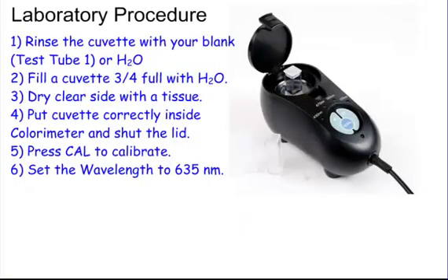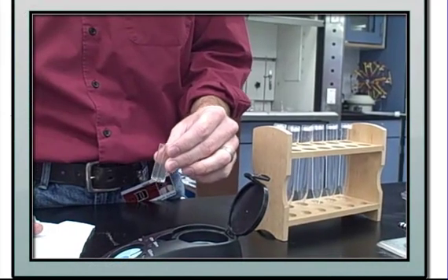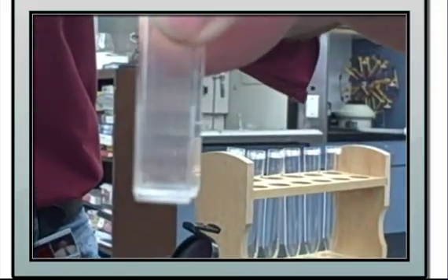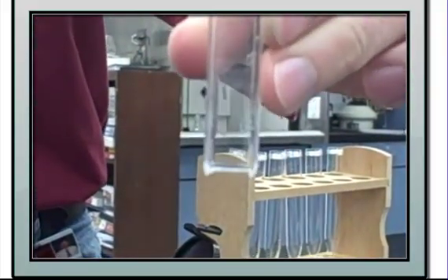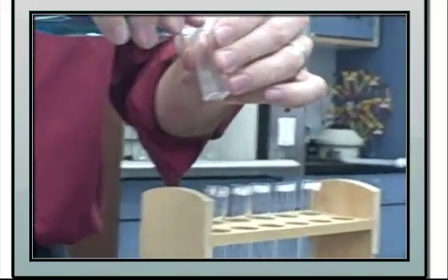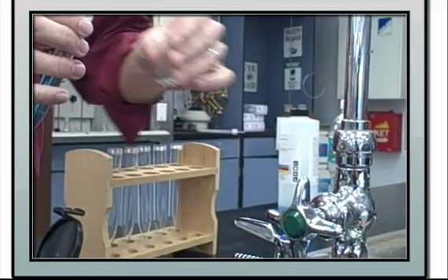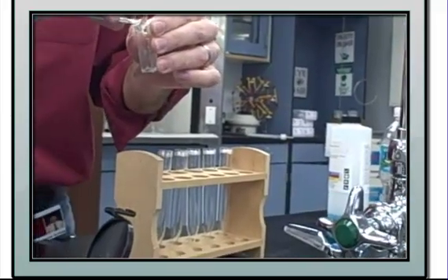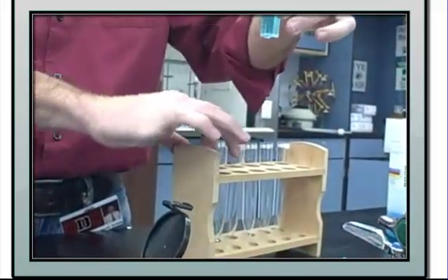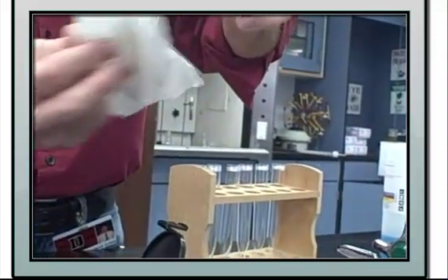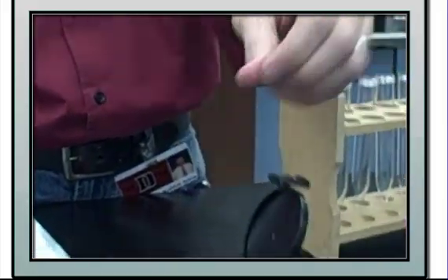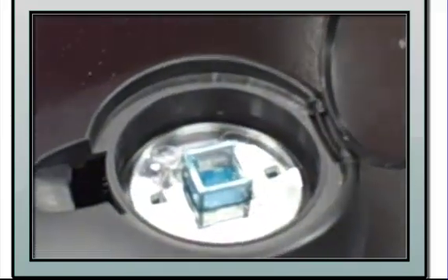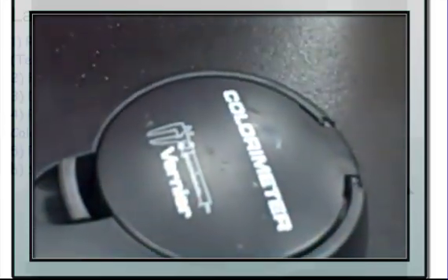Now for the colorimeter procedure — I'll show a quick video. The cuvette has rigid sides you hold and clear sides the light passes through. Pour the solution in, rinse twice, then fill it about three-quarters full. Dry off the outside making sure there are no drops, then place it in the colorimeter with the arrow aligned toward where the light passes through, and close the lid.